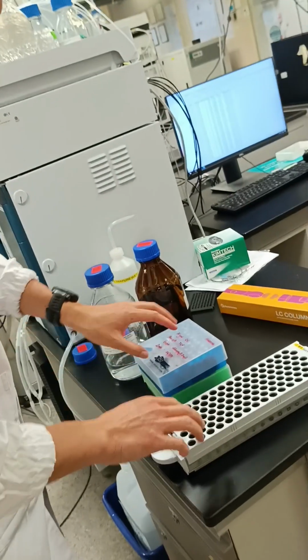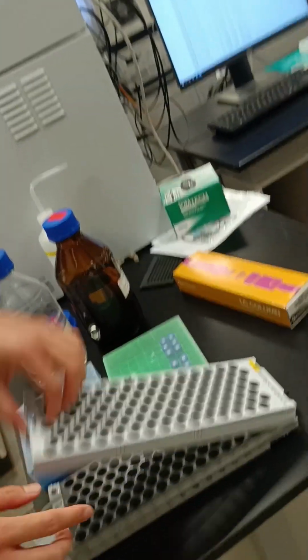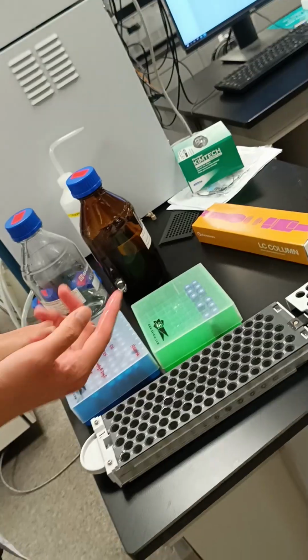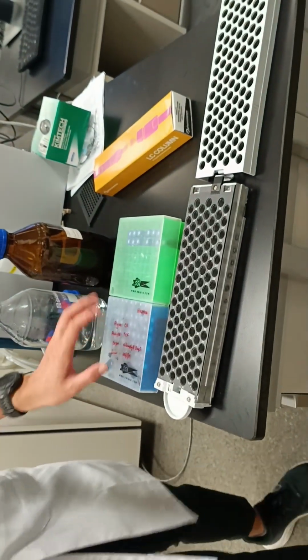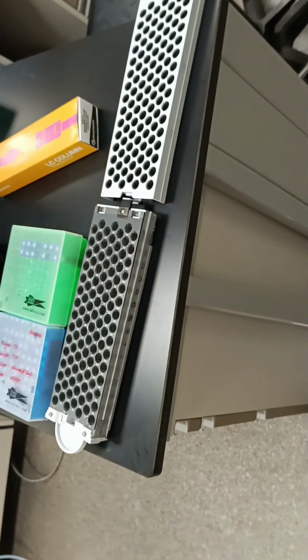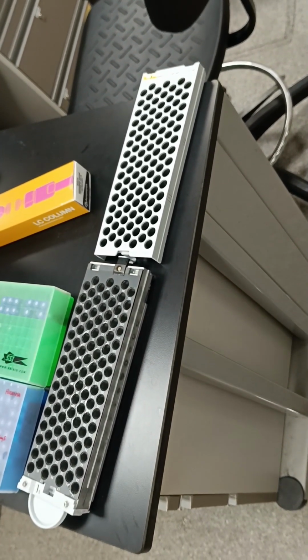So this is the rack, 105 vials. What I have to do is just load it according to the sequence that I keyed in just now. So these are my samples, and I have my blanks and QC here as well.